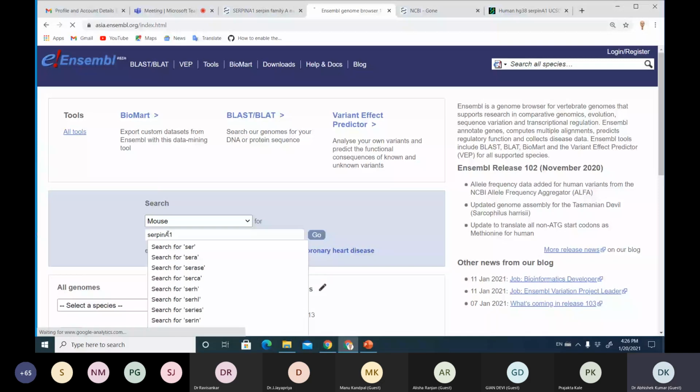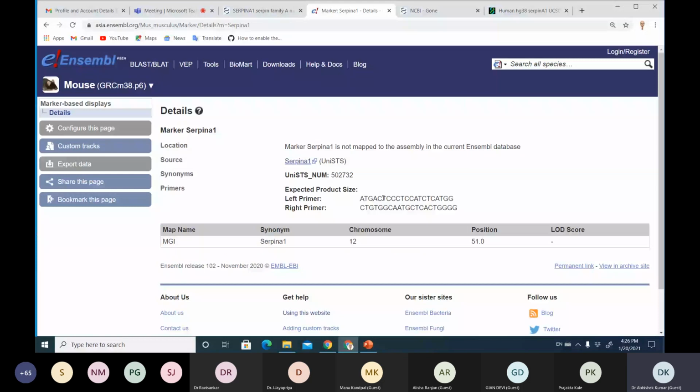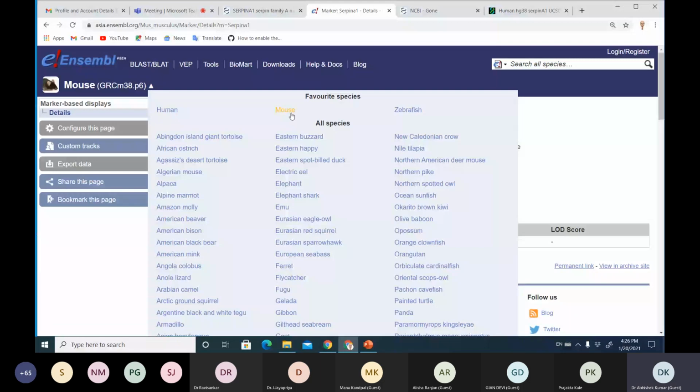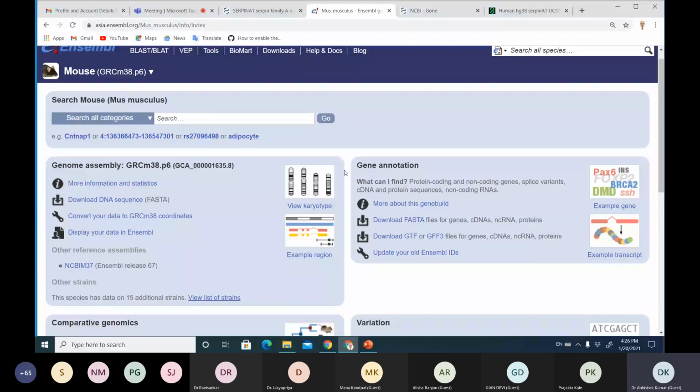This has been recognized, but then again the same problem. Okay, how can I reach there in this mouse assembly? It's easy to say, but difficult to see. Sometimes you may have to tweak the software a little bit, and then I'm doing it.